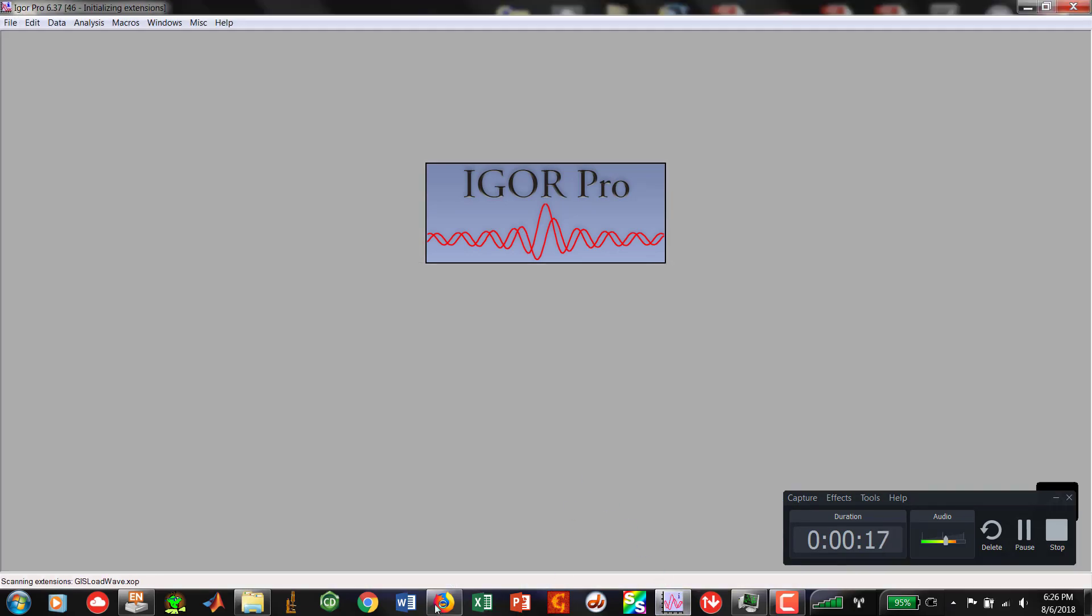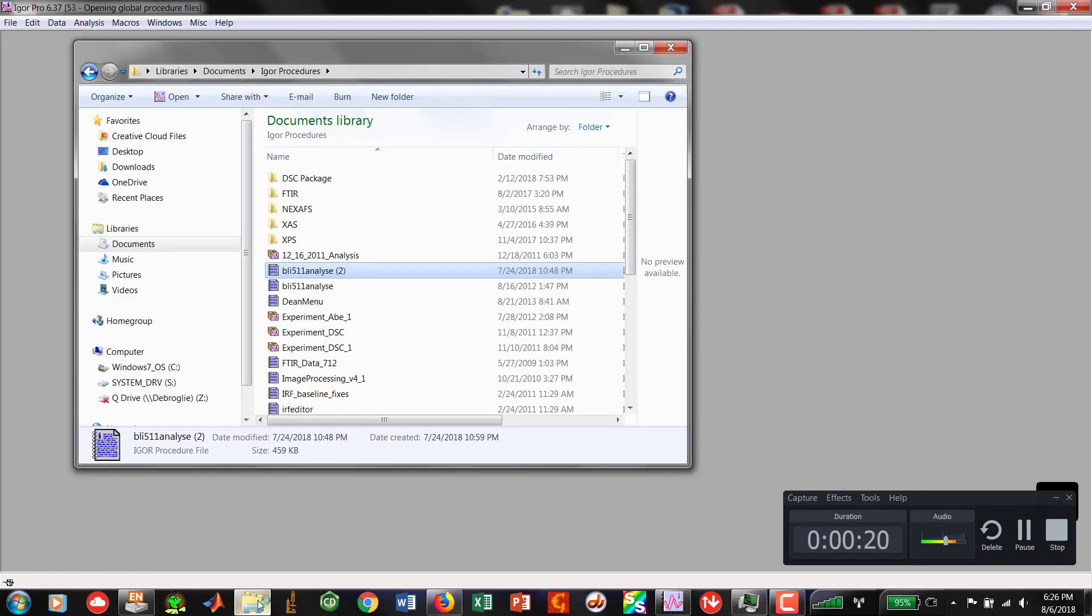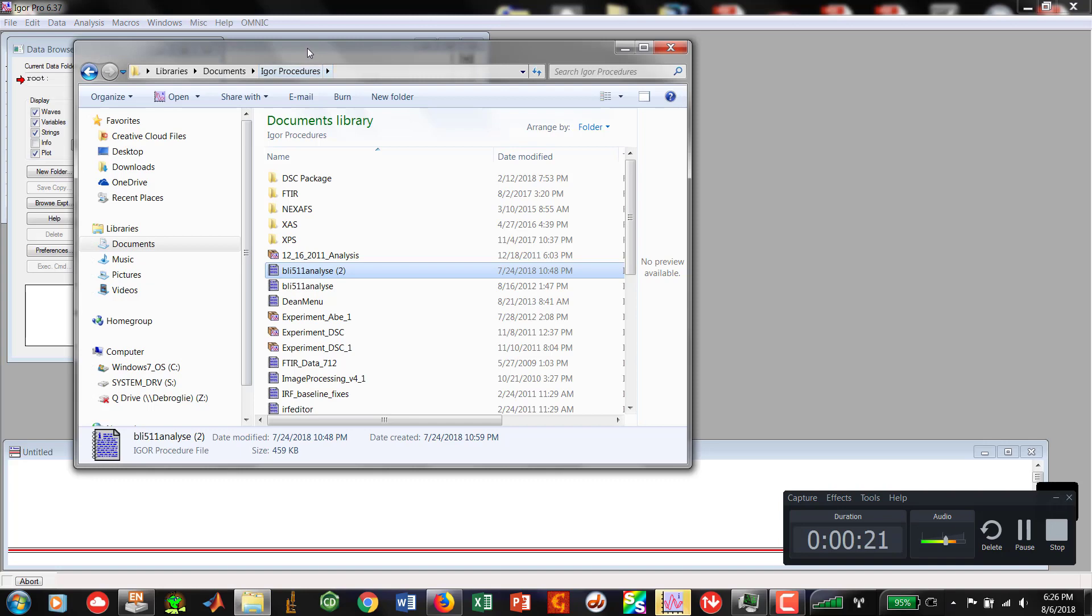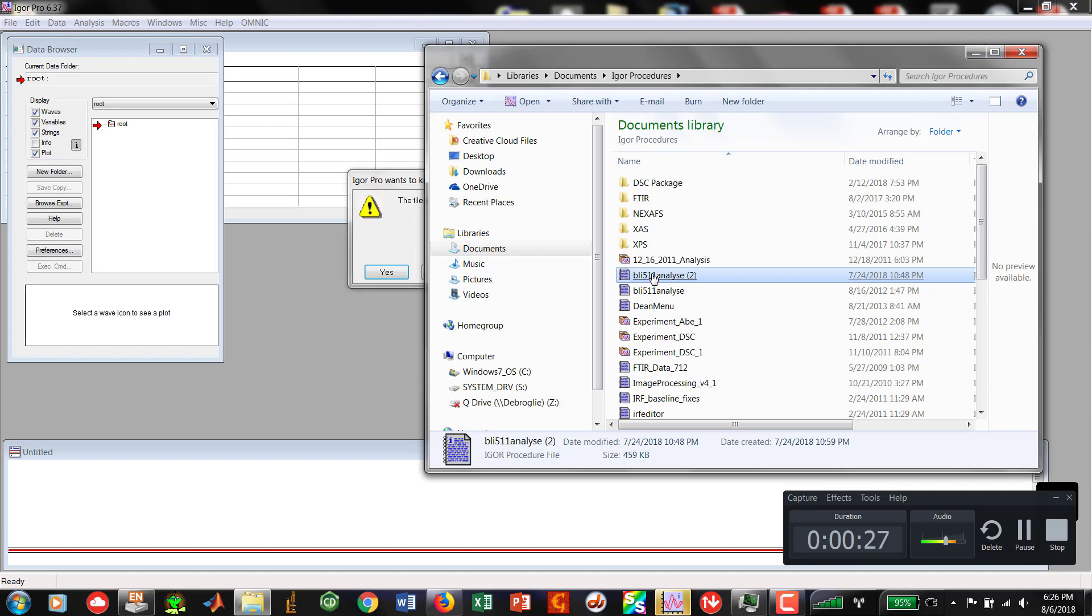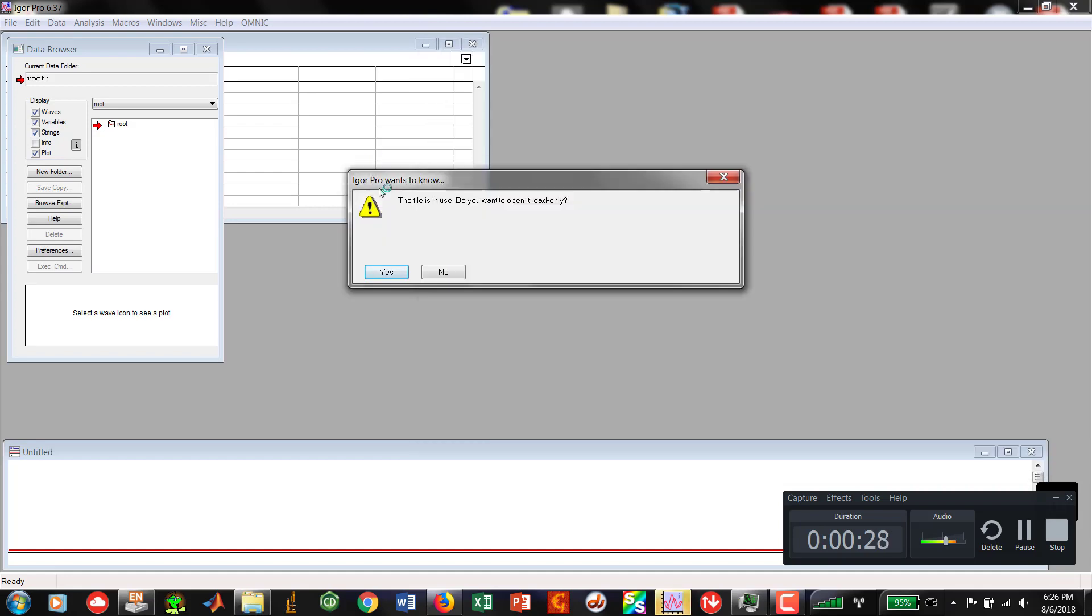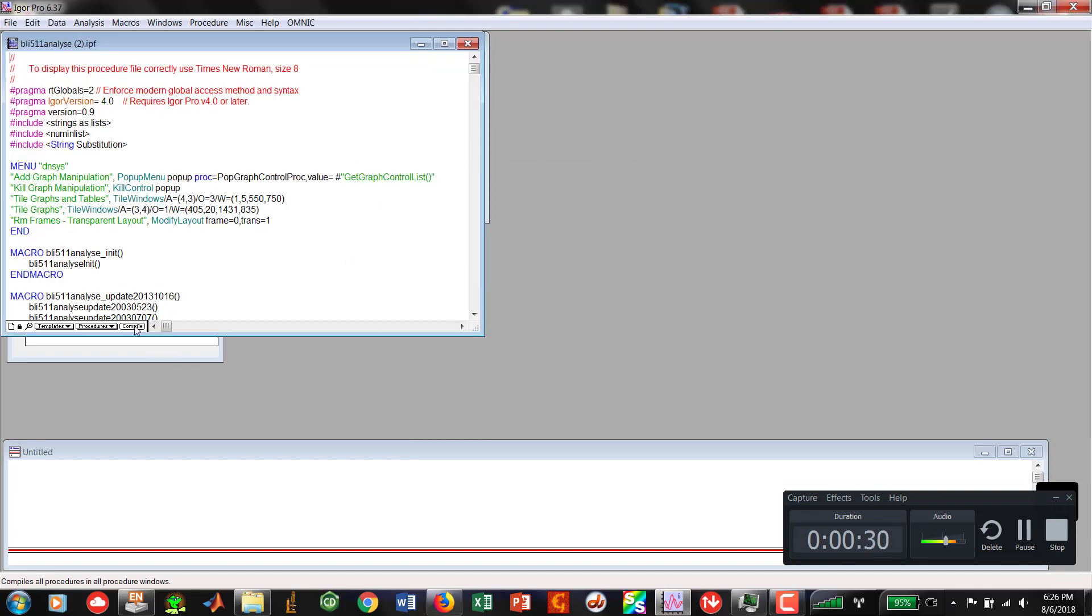I'm going to click on our Igor Pro, get that fired up. I'm also going to bring up a folder which has our BLI 511 analysis. I'm going to go ahead, click on that guy, open it up, and compile.